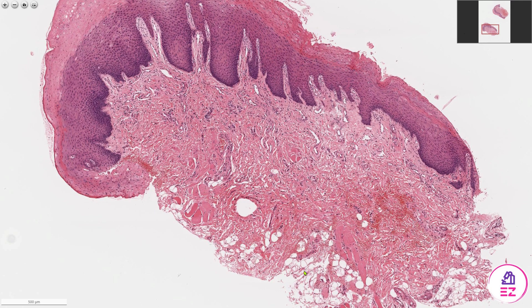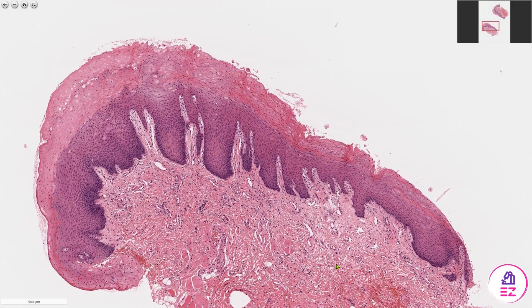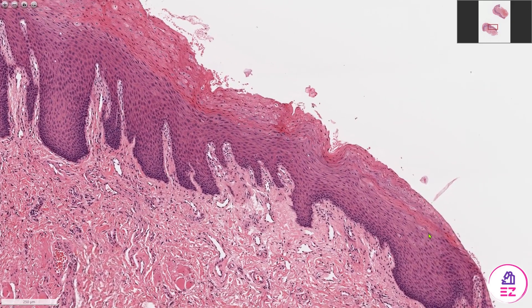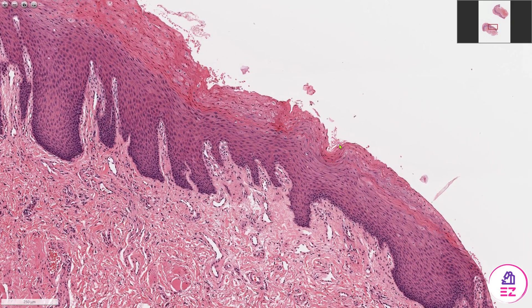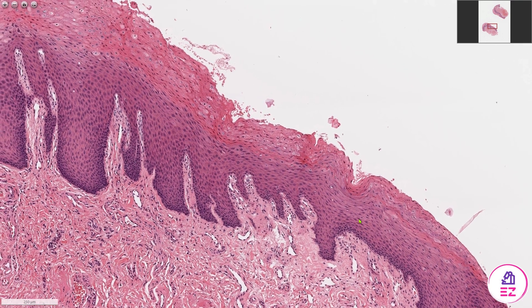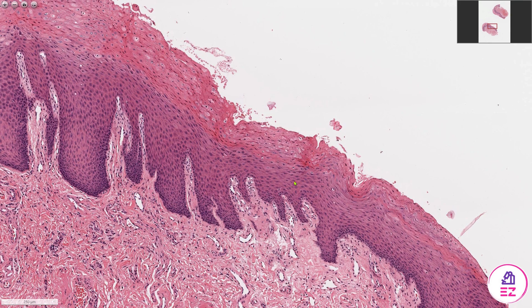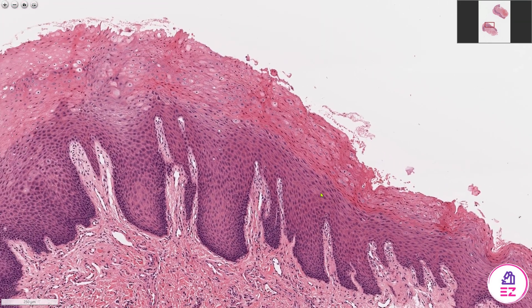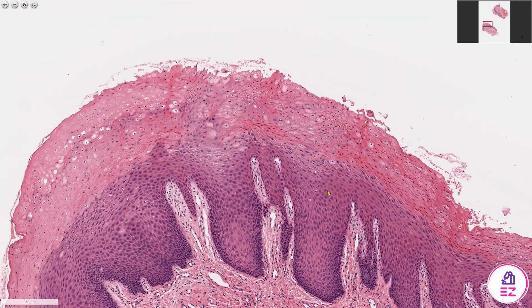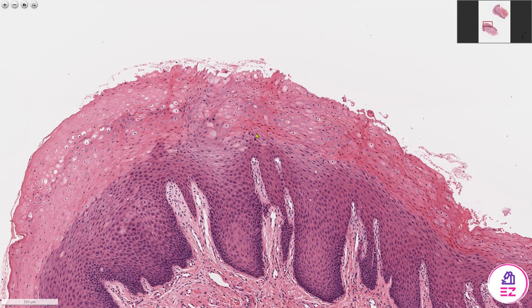The buccal mucosa is an example of lining mucosa, so it's not normally keratinised. If we look at this end of the biopsy, we can see there's a thin layer of keratin, so even here the epithelium isn't completely normal. But as we progress along the length of the biopsy, hopefully you can appreciate that the thickness of keratin has increased markedly.